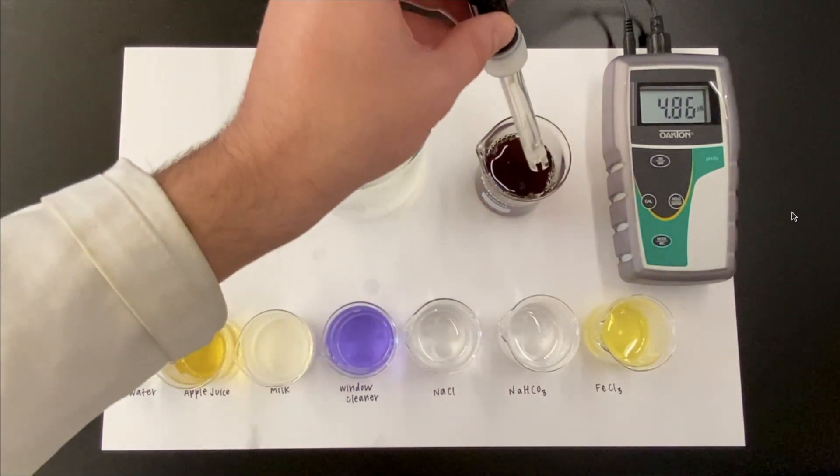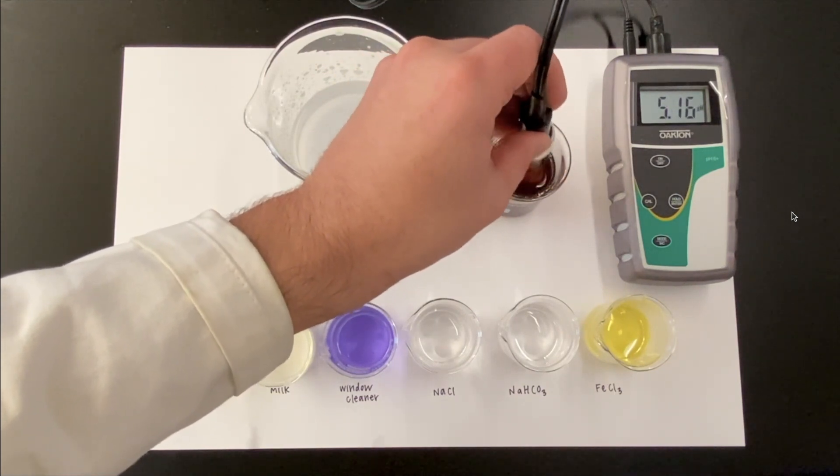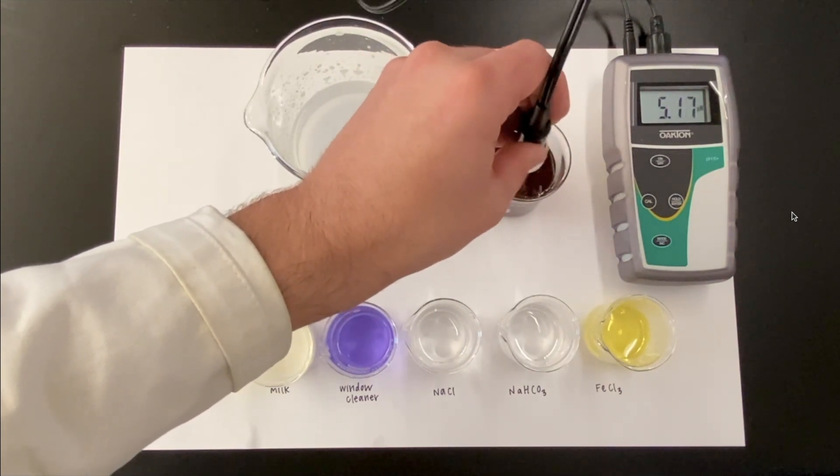In this last one, I was just drinking some coffee and wondered how acidic it was because it always gives me heartburn, so we checked it out — it's acidic.